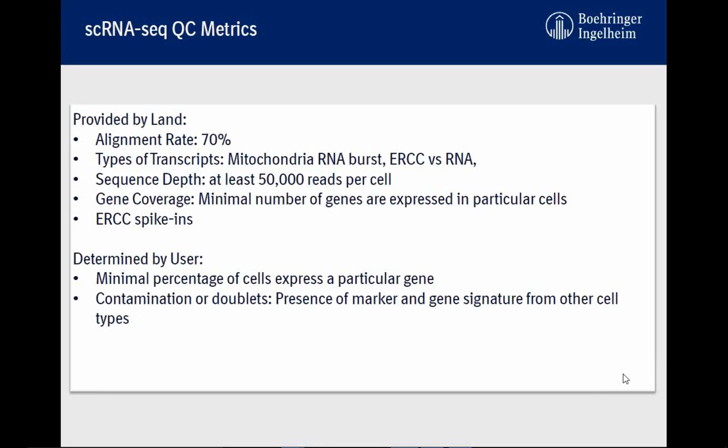And also, I'm extremely careful about contamination and doublets. The authors who load their data into public space already curate the data sets carefully, because they don't want to share all the data with everyone and then have others find a lot of problems. It's kind of shameful for them. So they oftentimes clean the data, but sometimes they overlook problems too. So we need to be really, really careful about that.